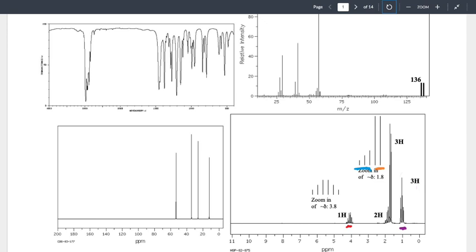Orange. Aren't you glad there's only 1 hour left? How many peaks for the orange signal? No. And sorry, Dewey, Joshua, you can speak up again. Ah, so we have overlapping signals, and that's where we have to decide how those overlapping signals come into play.